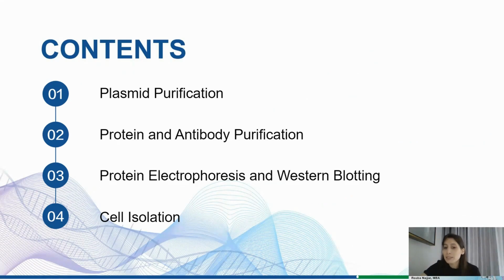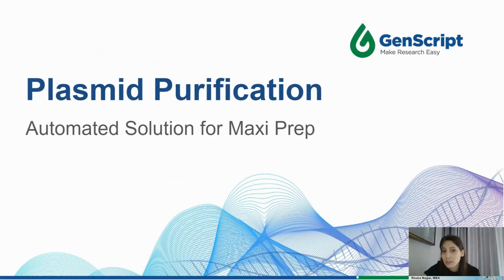For today, I'm going to be taking you through a couple different workflow applications that the team has really developed and fine-tuned. The first one is going to be the plasmid purification. After that, I'll be talking about the protein and antibody purification solutions, and then the protein electrophoresis and Western, and finally the cell isolation. And of course, at the end, I'll have some time to take some questions.